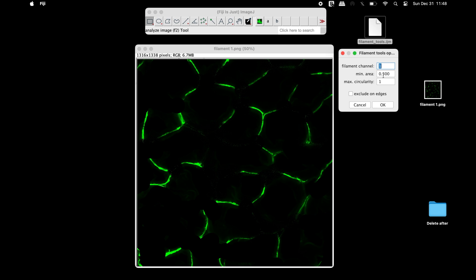Set the minimum area to specify the smallest area an object must have in order to be termed a filament. The maximum circularity can be set accordingly to allow the removal of objects that are too spherical to be filaments.